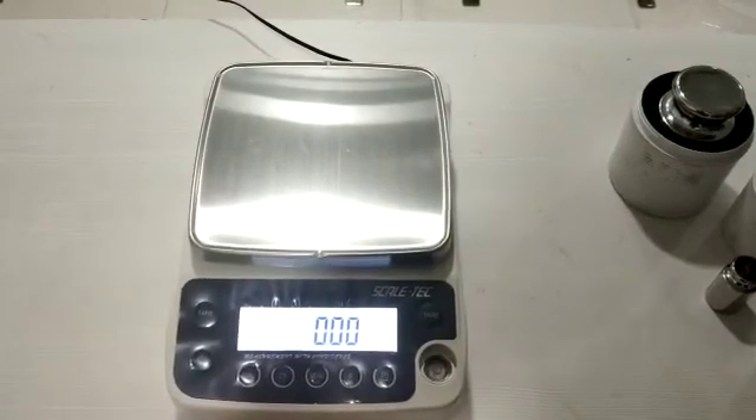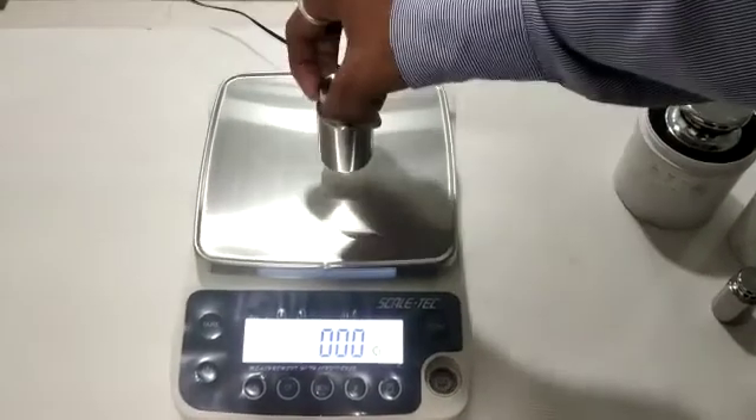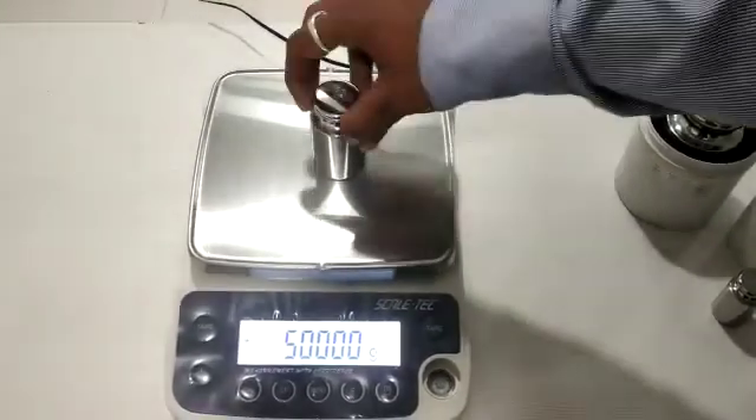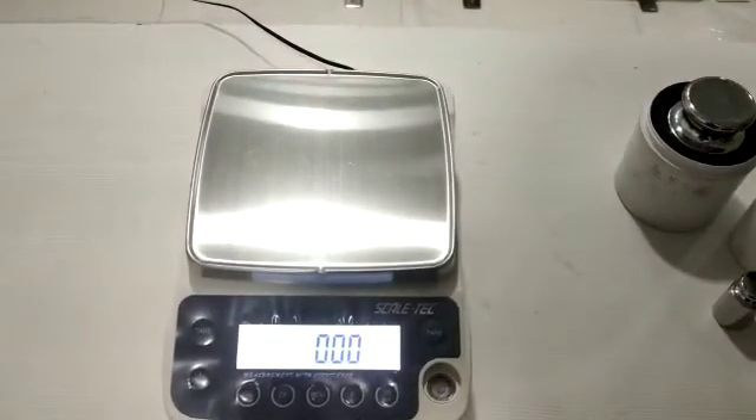Then 500 gram, and at the end again 200 gram.